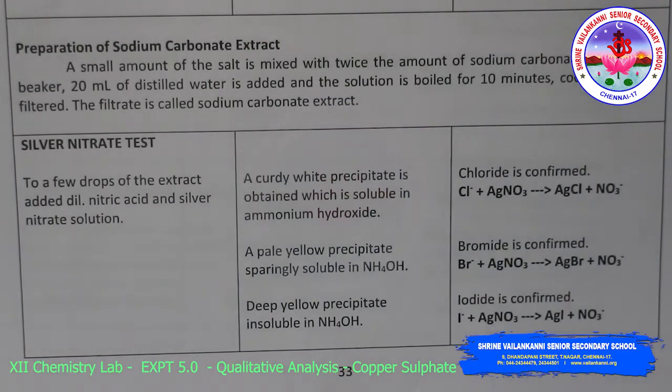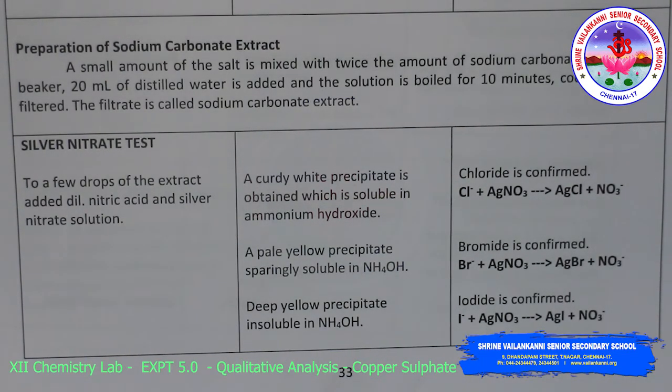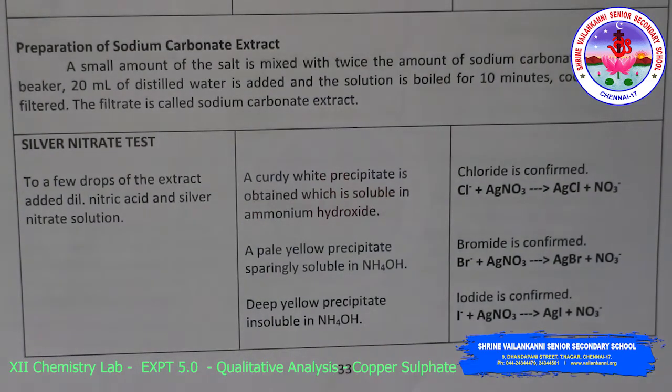After preparation of the sodium carbonate extract, you have to do some experiments with the extract solution, that is, identification of acid radicals and confirmation tests for acid radicals. Here, the silver nitrate test.